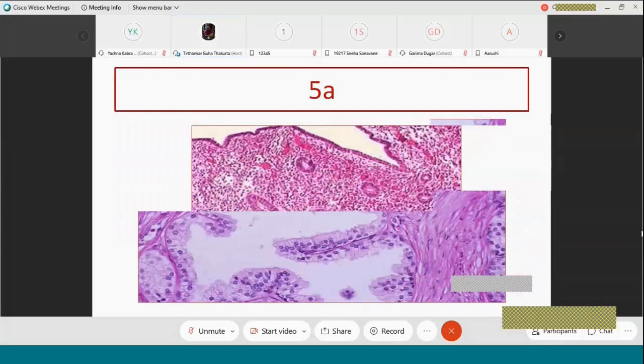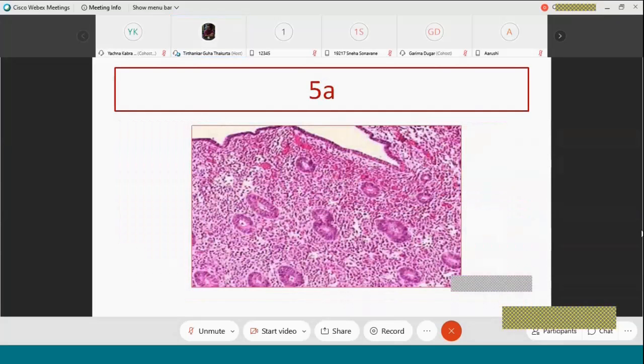What is this? We have already discussed this. A tissue with a granular matrix and round glands with rich cell division going on everywhere.